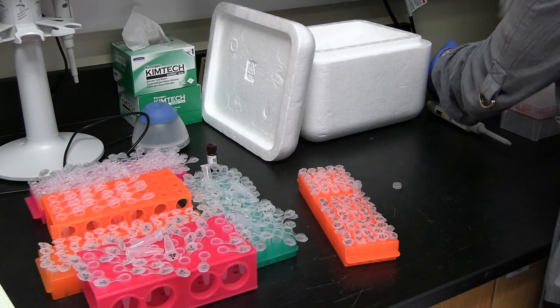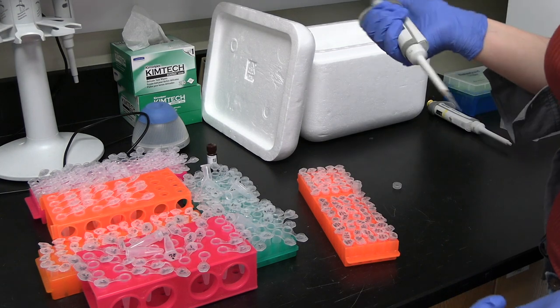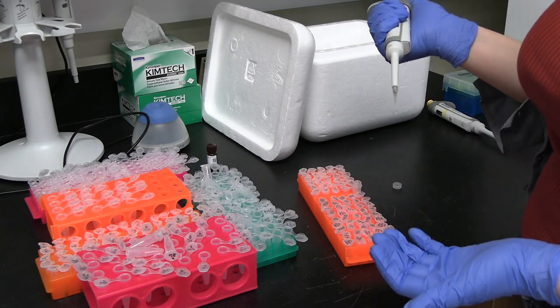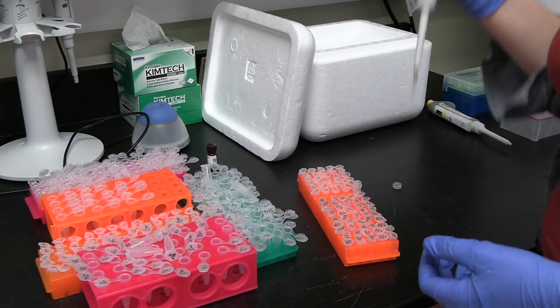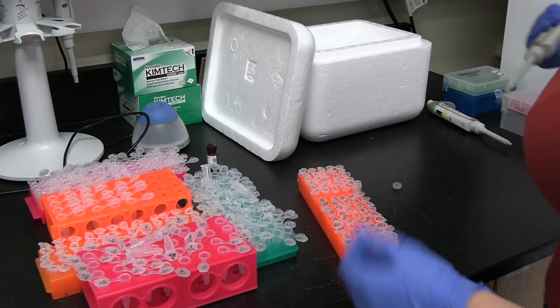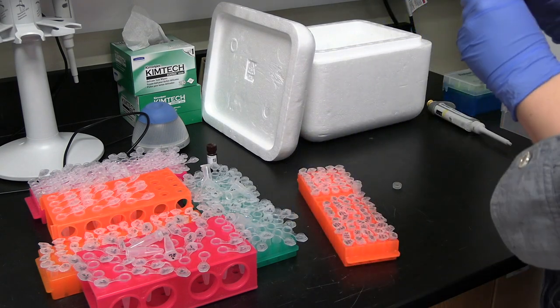Set my pipetter to 2.5 microliters, get a small tip. Okay, I can reuse this tip for as long as I can tell that it's kept on there stably. If you're making a protocol, you should replace your pipette tip, obviously, with every single step, but for aliquotting, when you're aliquotting the same thing over and over, you can use it for multiple rounds.